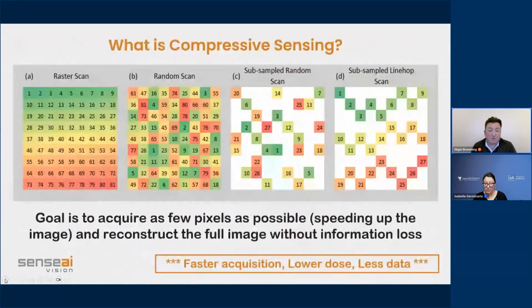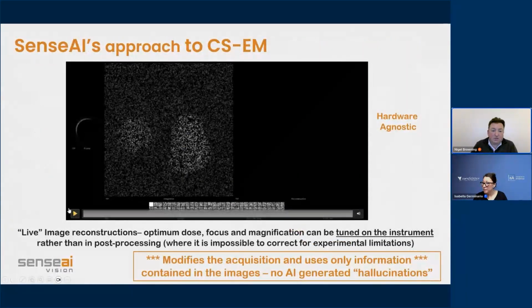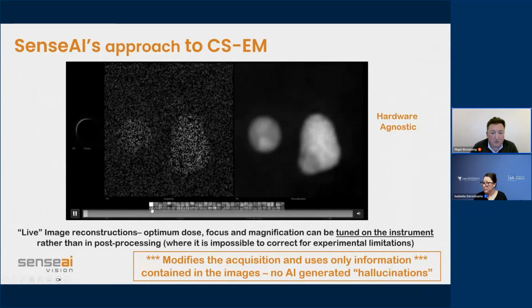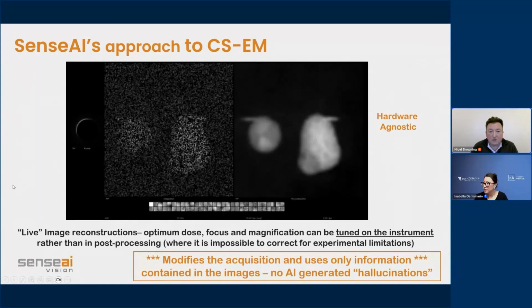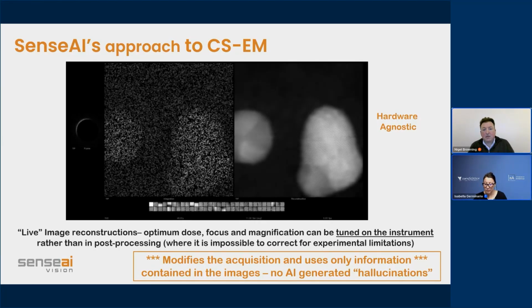And actually that one would have worked if you run that movie again. Sure. So if you look at the dictionary at the bottom, when it starts, you can see the dictionary is changing to fit the sparsely sampled image. And if you like, those pixels that we are sampling are our ground truth. So the dictionary elements are being refined so that the image fits the pixels we have of our ground truth in these patches, and then fits into the missing information to form that reconstruction. And that's the process going forward.